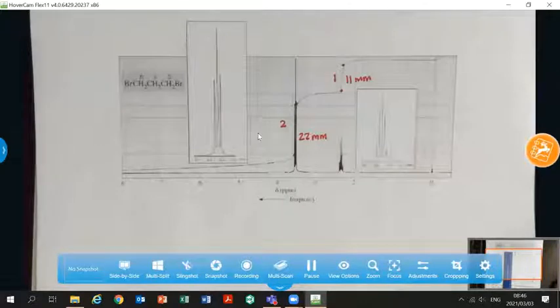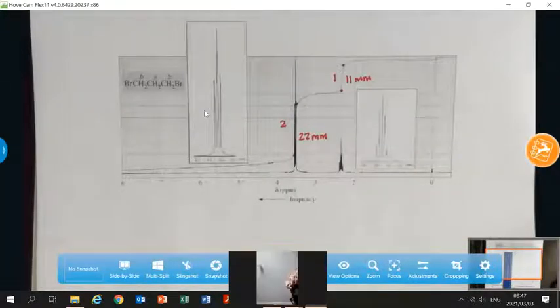So if I look at this, in many cases you'll get a molecular formula, C3H6Br2. We'll give you a molecular formula, C3H6Br2. And if you see H6 here, then okay, there must be something that I need to do with these numbers, because I've got 6 protons, but I can only see 2 and 1 here, that's 3. I can see half the number of protons, which means I need to multiply that by 2, or there must be some symmetry in the molecule that I am trying to work the structure out. Right? So let's have a look at this particular molecule.